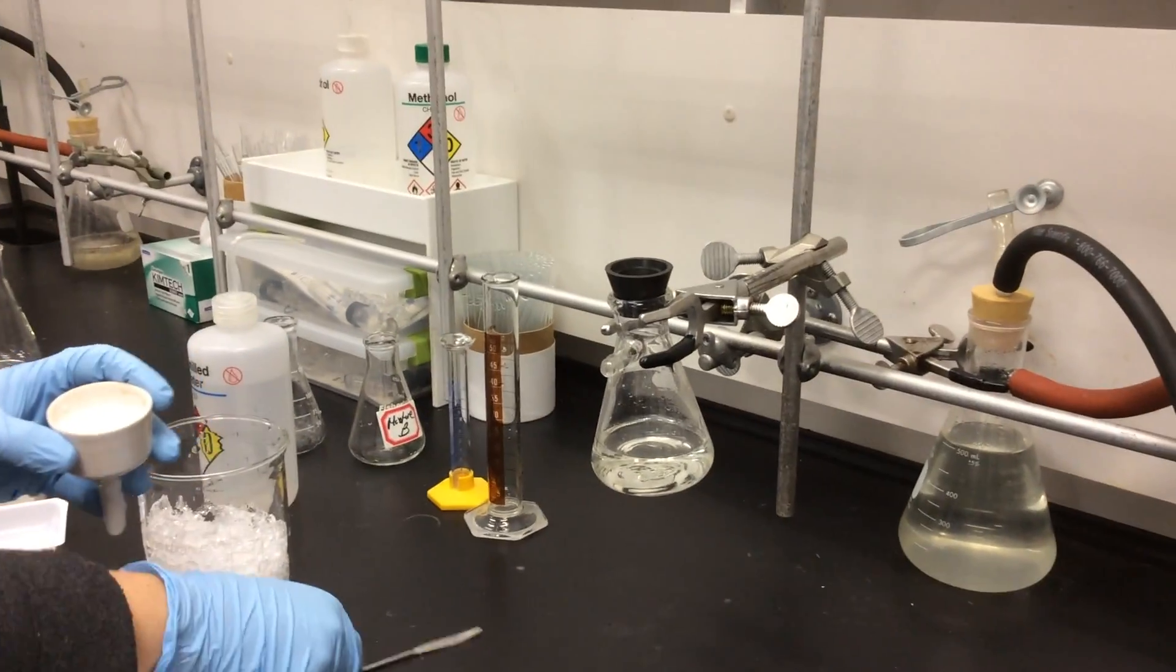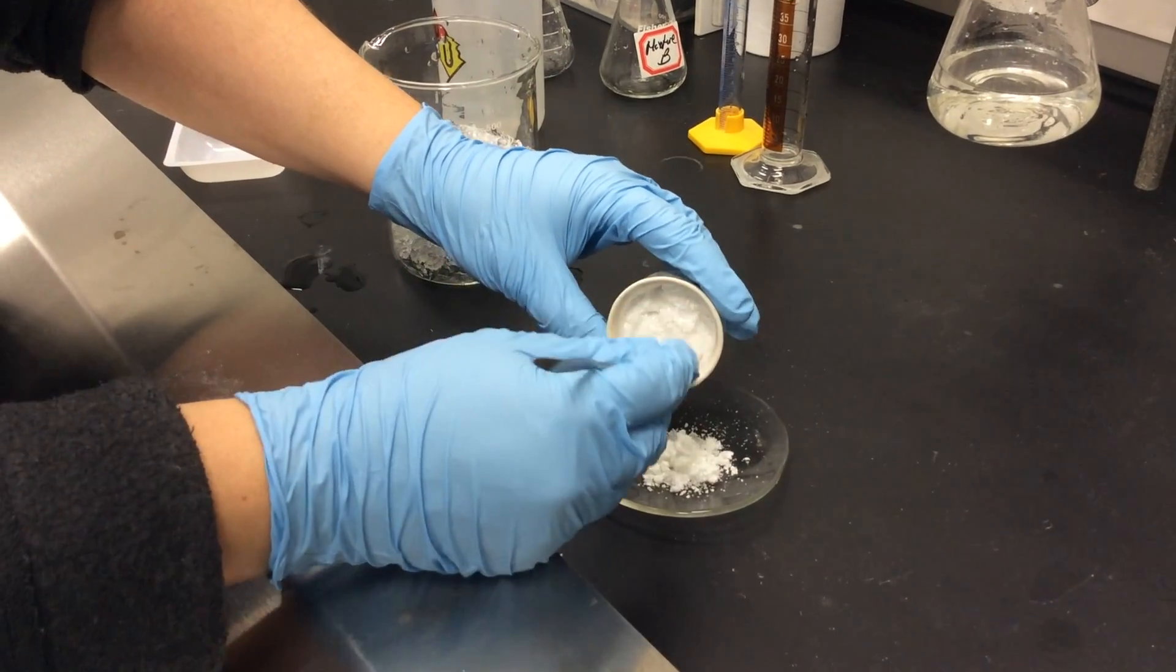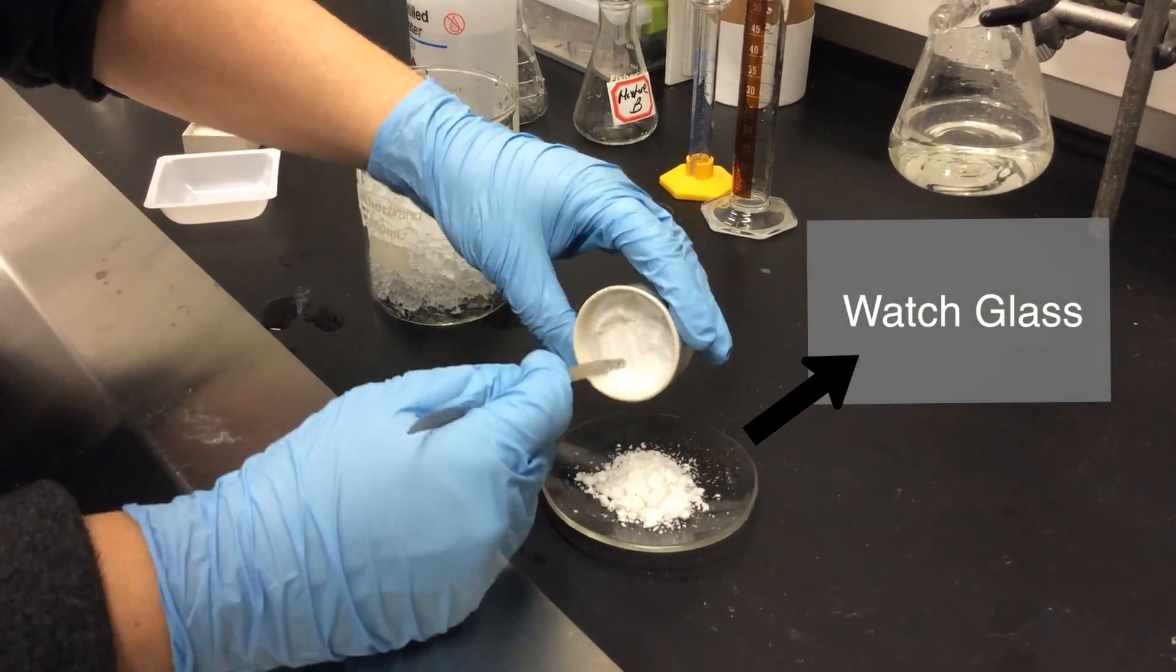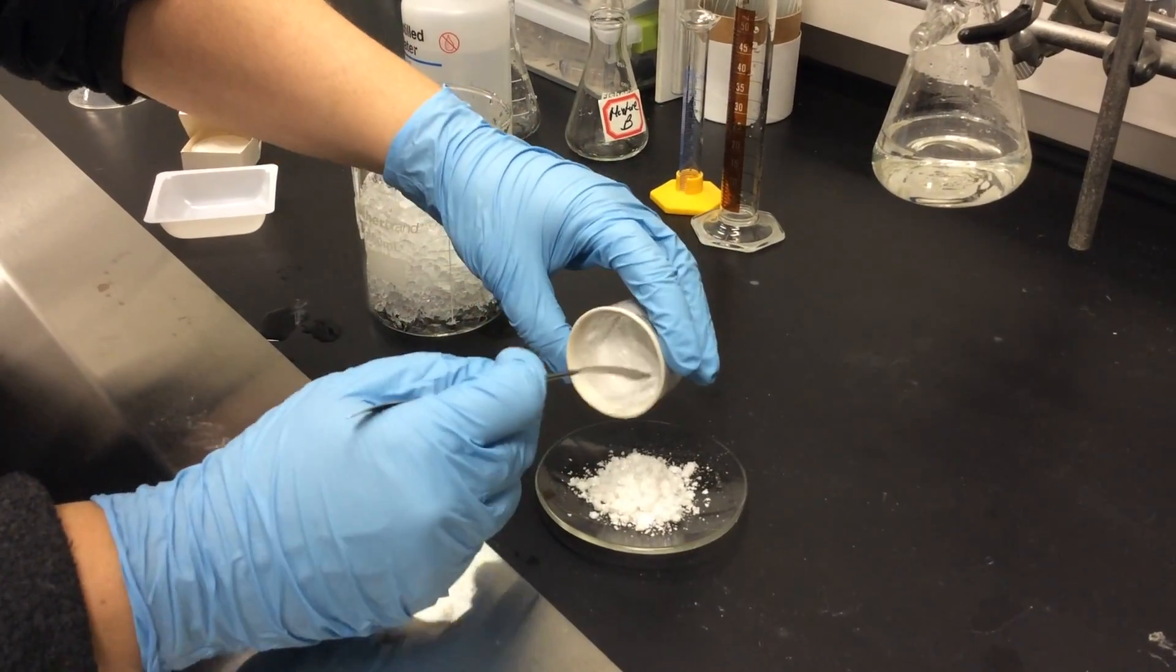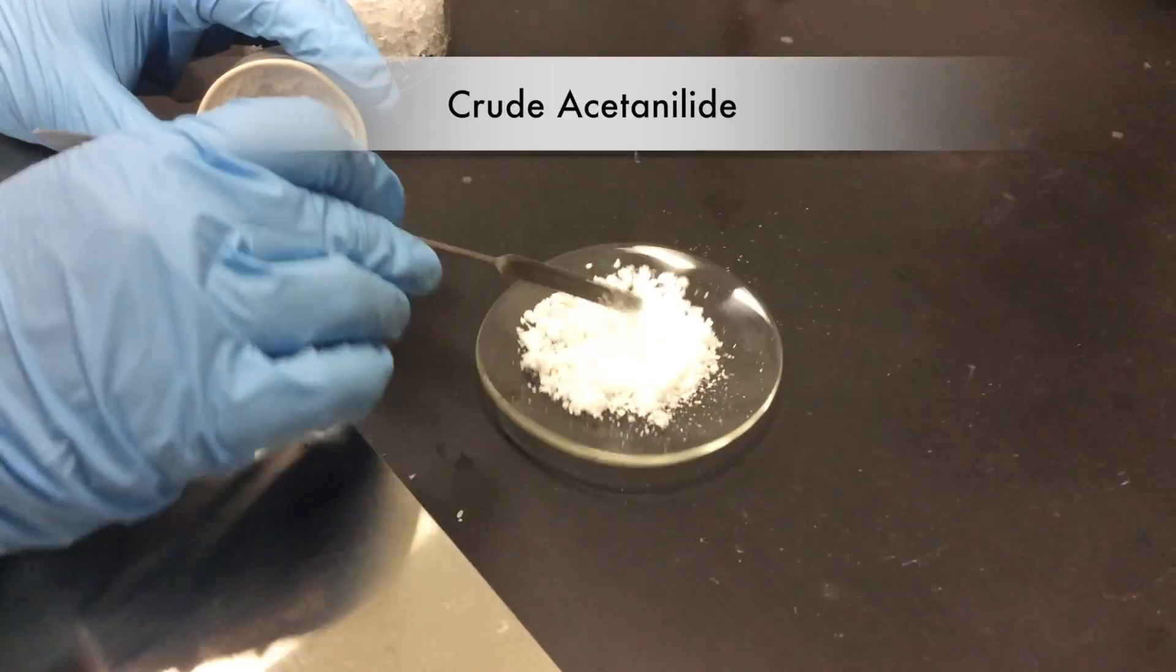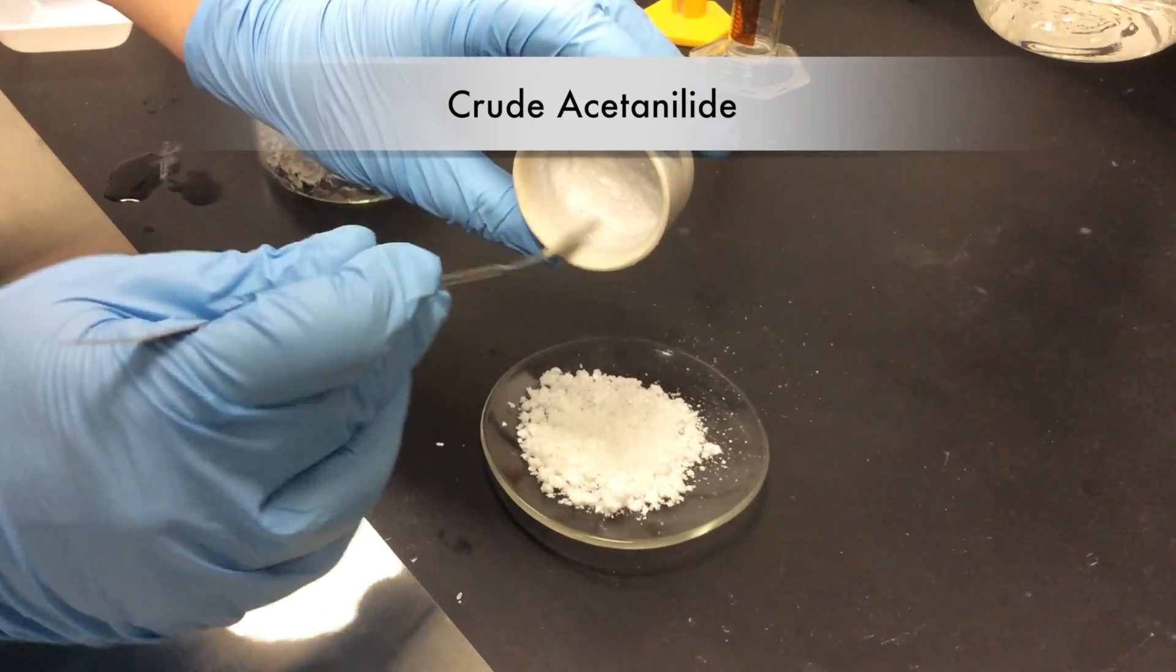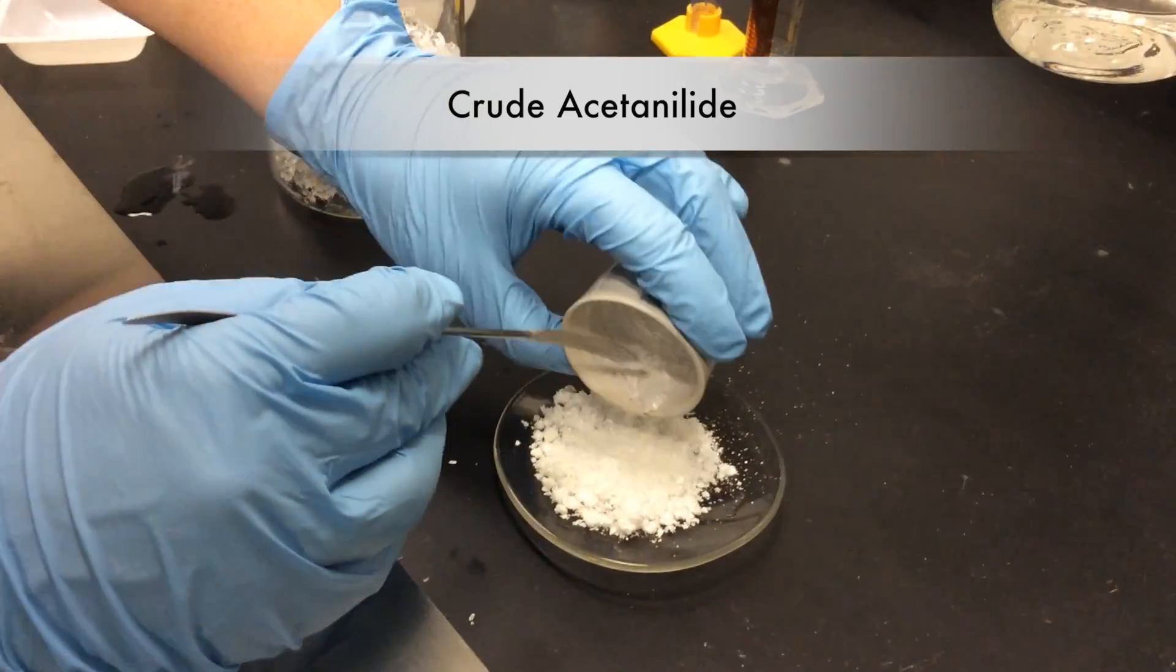Then take the Buchner funnel out of the flask, and just gently put your crystals onto a watch glass. You can see we're collecting all our nice white crystals here. And be careful to gingerly only take out the crystals and not the filter paper. You can see I'm breaking up the crystals, so the maximum amount of surface area is exposed to the air, so that we can get maximum amount of drying.